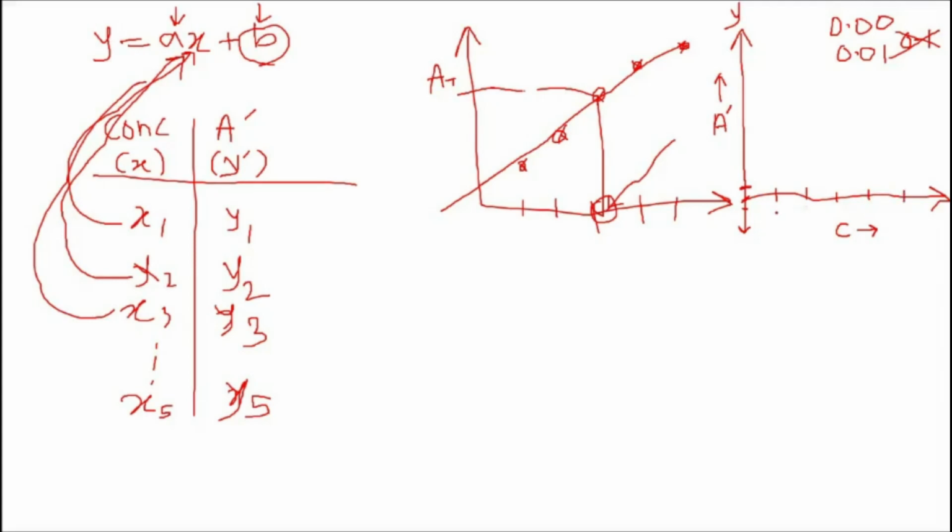Okay, आपको पता आपके concentrations कौन से 2, 4, 6, 8 and 10. Now, instead of plotting all the respective points on the graph, just focus on the point of concentration 10 and plot that particular point.